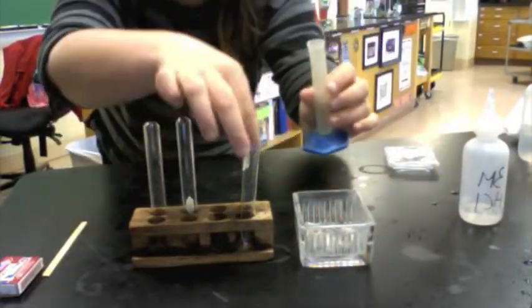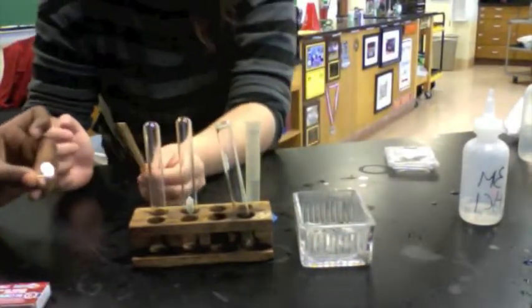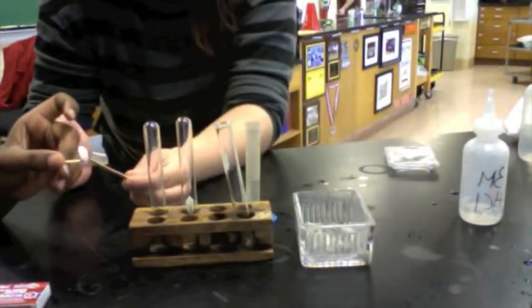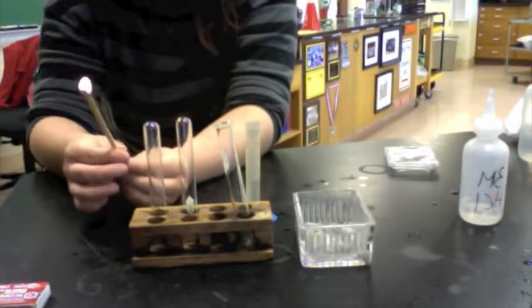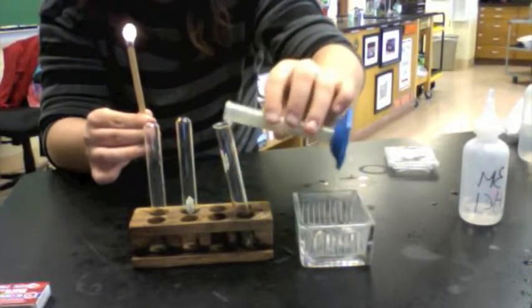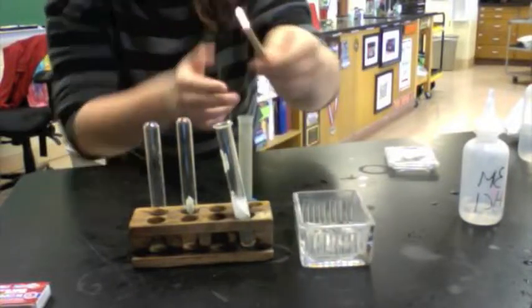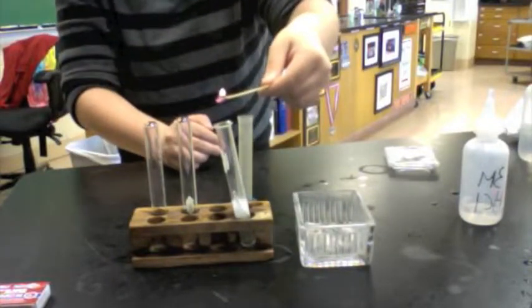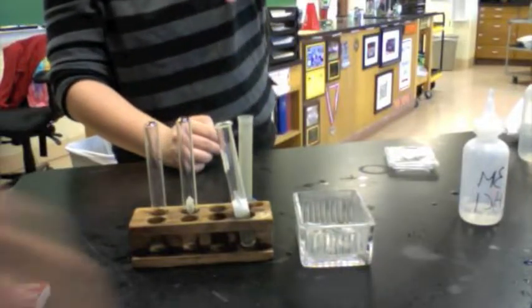Before we added the HCl, we made sure that we lit the wooden splint. Once the wooden splint is fully lit, keep it fully lit — do not try to put it out. Then you can add the HCl. Once you add the HCl, put the wooden splint over the test tube. The popping noise should indicate the presence of hydrogen.